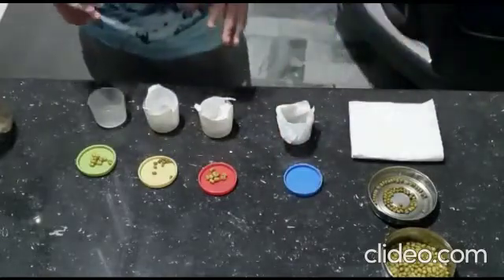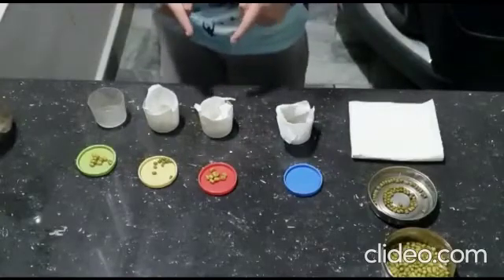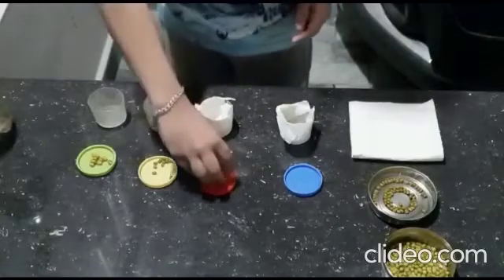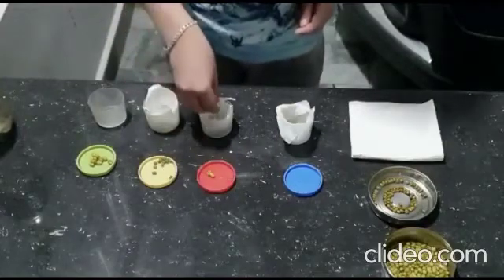In the second cup, I have placed a paper towel. I am not going to wet that. I am going to straightaway put pre-soaked seeds in it.